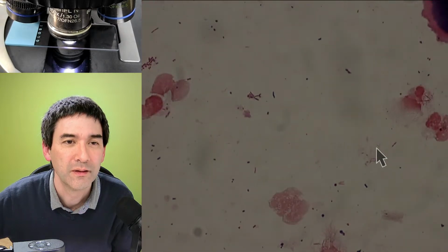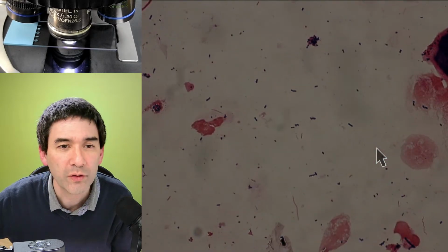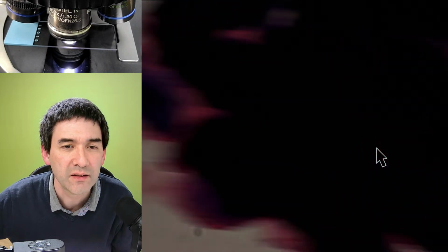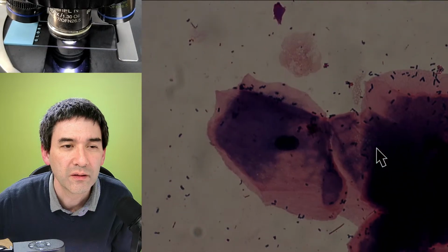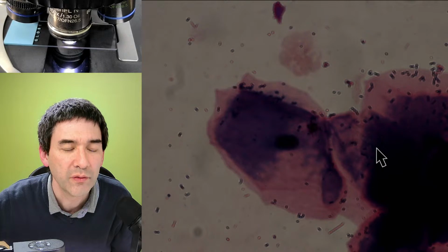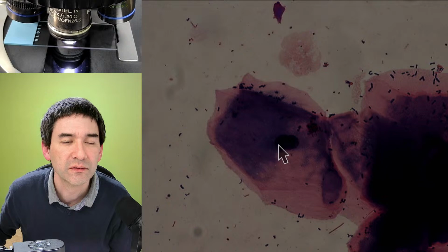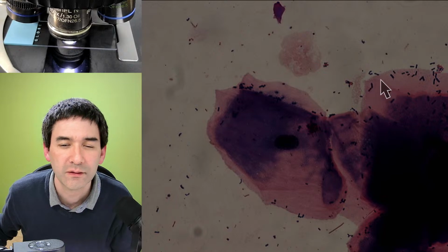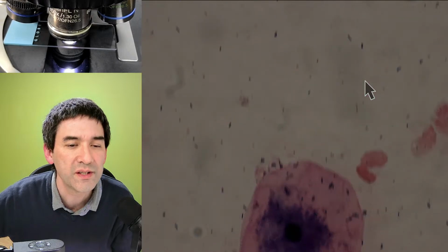Let me see where else, maybe let's move over here a little bit. These here are not completely destained yet. Here again, that's also one of those epithelial cells with a nucleus in the center. And those things here, all bacteria. And we could not see them before.